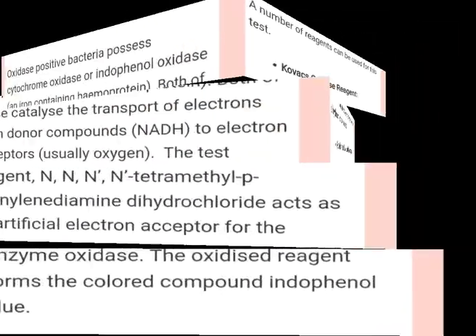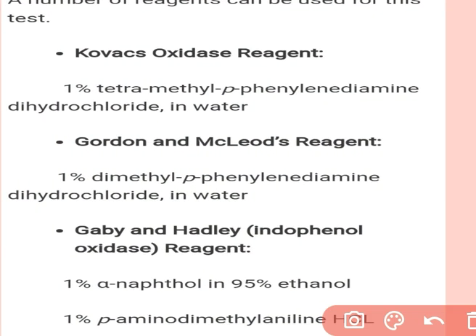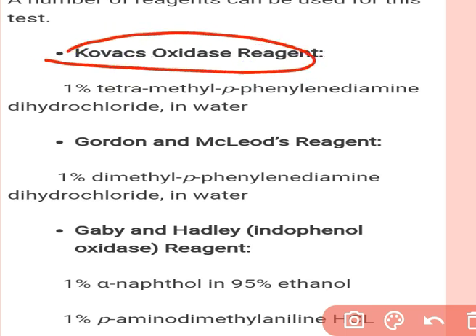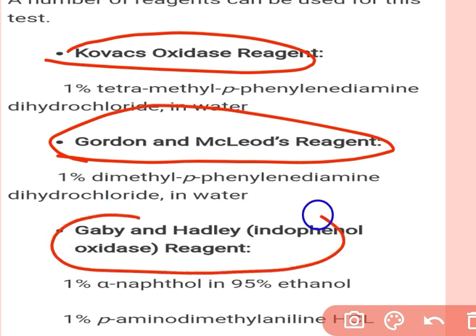A number of reagents are used for this test. We can make a use of a Kovacs oxidase reagent, or a Gordon and MacLeod reagent, or a Gaby and Hadley reagent.